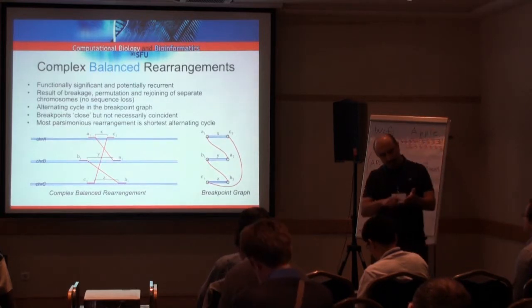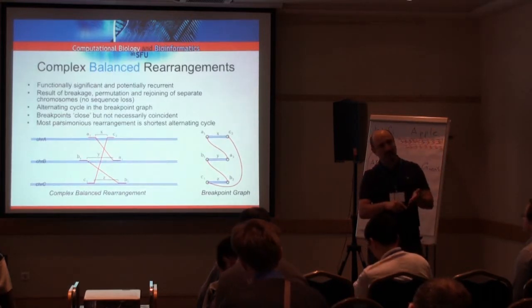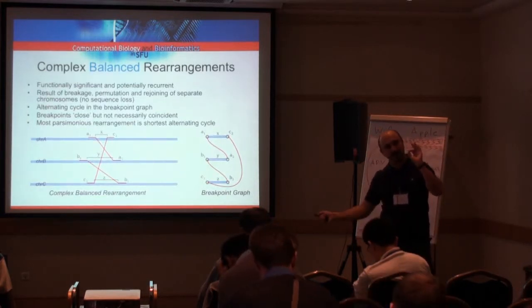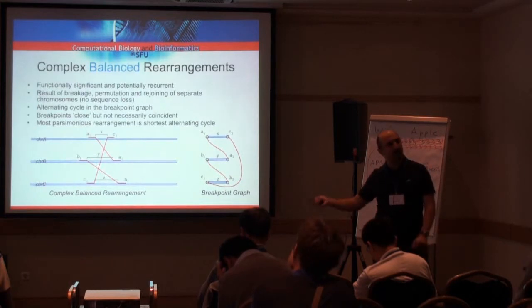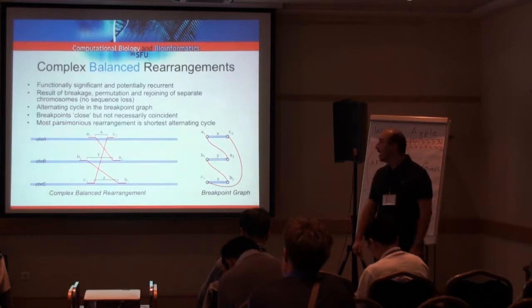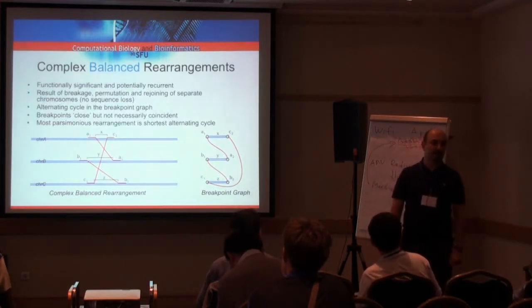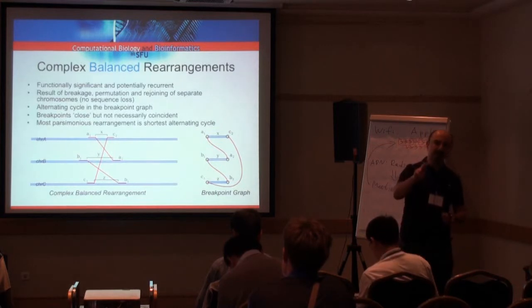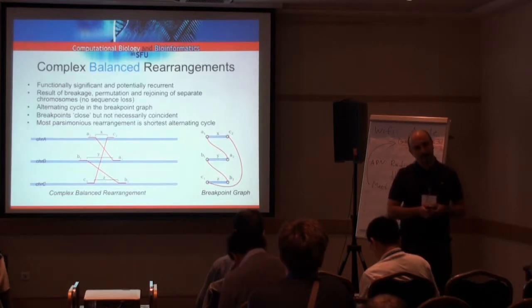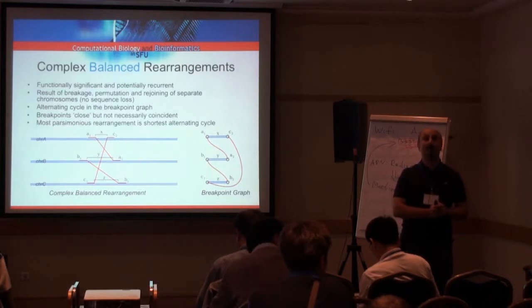So we are looking for a cycle that seems to make sense. We are looking for the smallest number of fusions that can simultaneously happen to cover all the fusions that we analyzed. There's no repeats here. There are repeats. In fact, each read can be multiply mapped. Then the definition of alternating cycle is not defined.